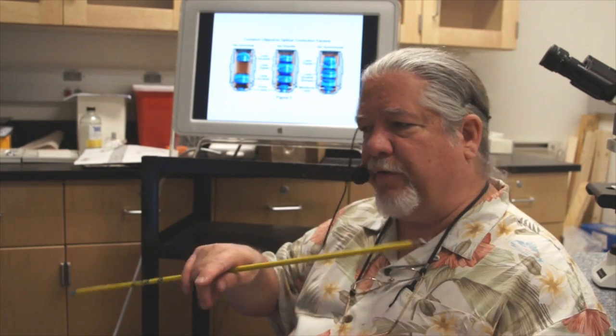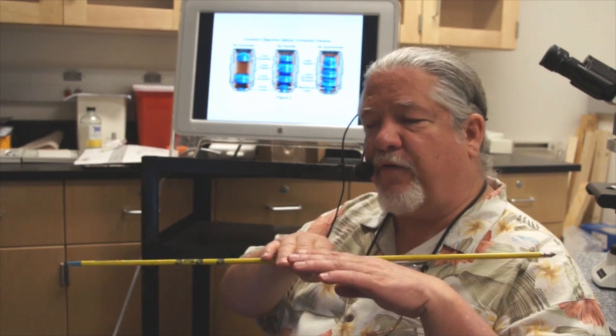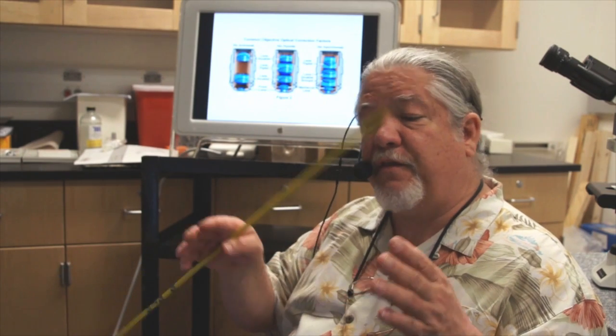So we would want to choose a plan objective that gives us a nice flat field of view. They don't show a plan objective here, but understand that we're correcting for flatness of field so that the entire field is in focus from edge to edge. So the Achromat is the least expensive objective. Then you go to plan Achromat.